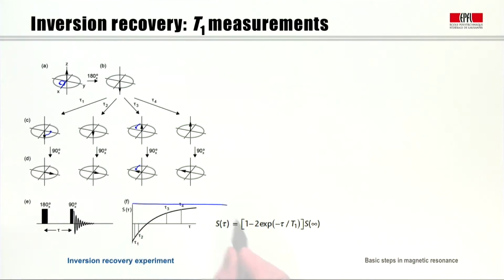And it turns out, as we know from the relaxation chapter, that this will converge to an asymptotic value, which is the equilibrium position of the magnetization. And the curve that we see here is simply given by the exponential, so the deviation delta is given by delta, its original value, times e to the minus t over T1.